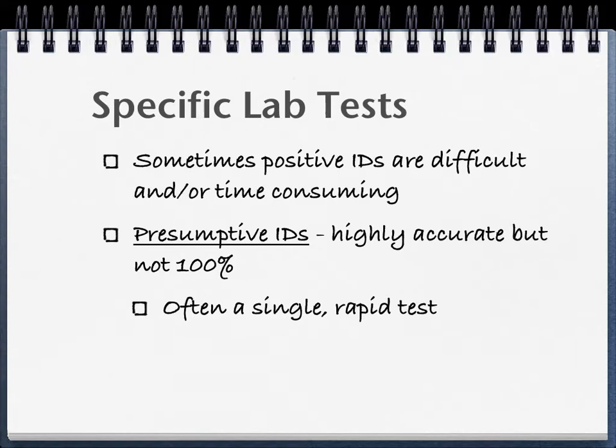Remember our biochemical test we did in Lab 11? I remember we inoculate, right? And then every time we inoculate, do we get back the results right away? A day, right? Always requires incubation, always takes minimum a day to get those results, right?